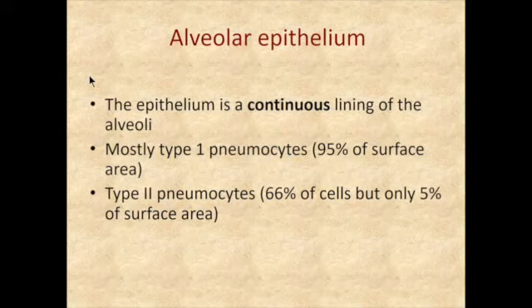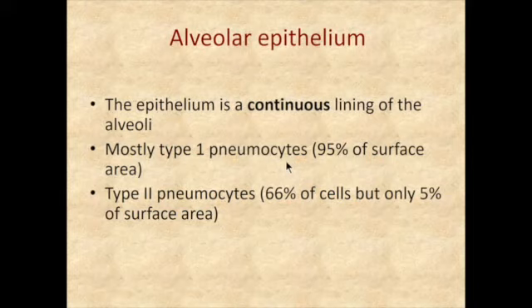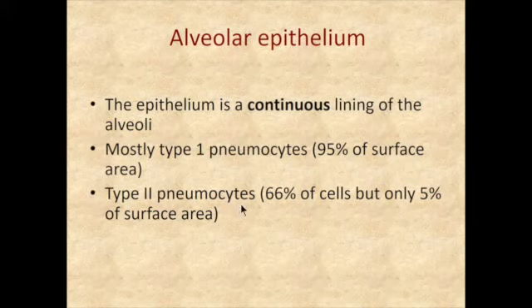The type 1 pneumocytes are very stretched out, so you can't really even see them as cells unless you cut through the nucleus. The type 2 pneumocytes are not as stretched out, so they're a lot rounder in shape. They supposedly make up more of the cell population and they take up the places where the alveoli come together, showing up in little bunches or groups.